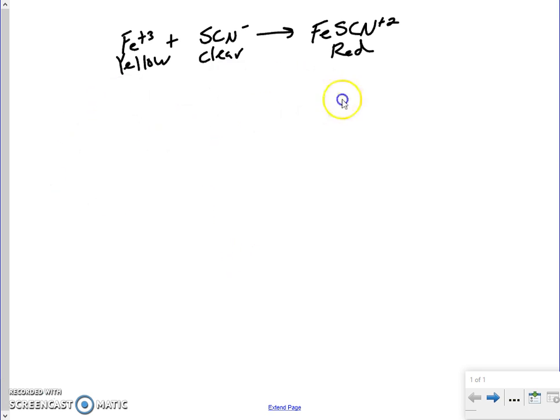So just so we can get an idea, we were measuring this guy's color, okay? Because remember, we were looking at that 430 range, which is around the blue range. And blue and red are those opposites in that spectrum, if we remember what's going on there. Okay, but let's talk about the actual math we have to do here.